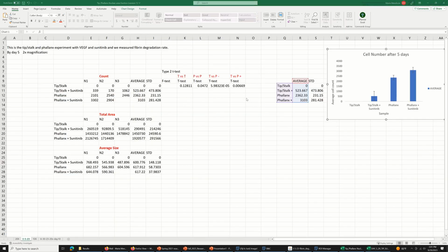Okay, so we're going to go ahead and do that. We're going to make our graphs for all of these things, so we'll be able to get 3 graphs from this data.